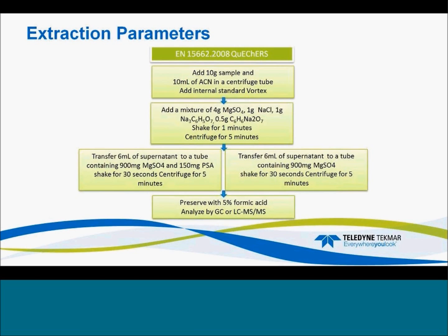So they follow the extraction parameters, 10 grams, 10 mLs. But one thing that they varied was that when the samples did need cleanup, they would use magnesium sulfate and PSA. But when they were running a sample they knew did not need a cleanup, they would just use magnesium sulfate to help dry it out and remove excess water from that organic layer.